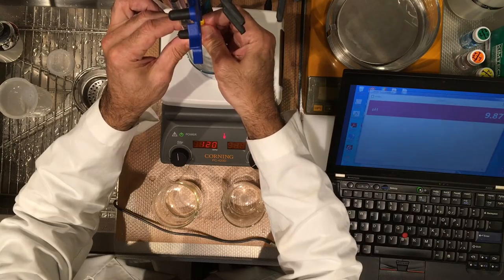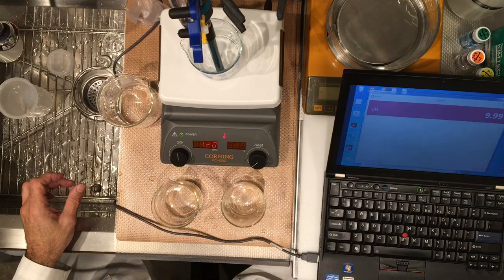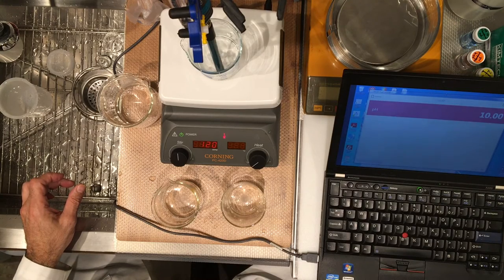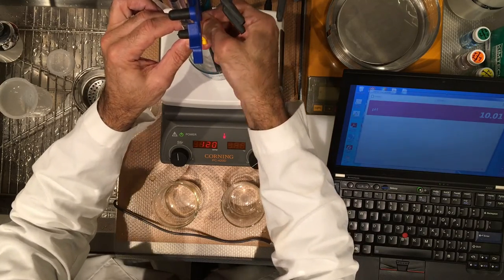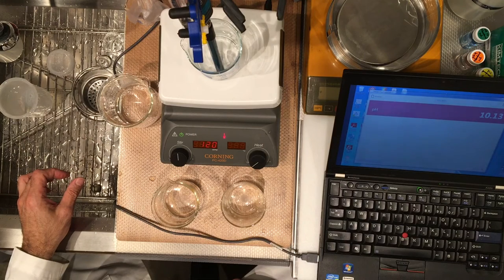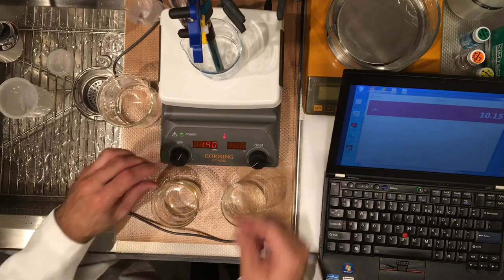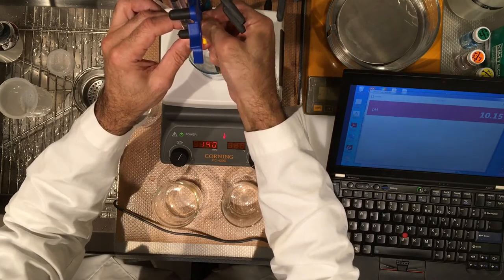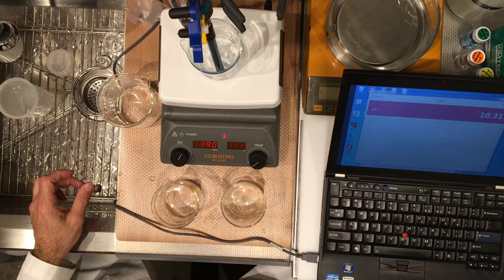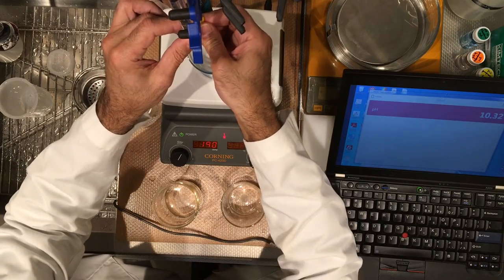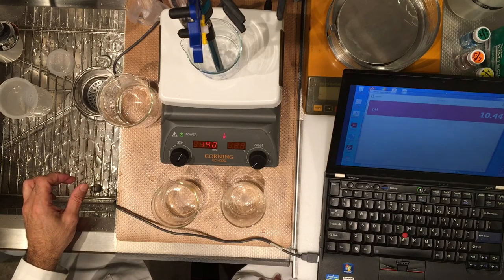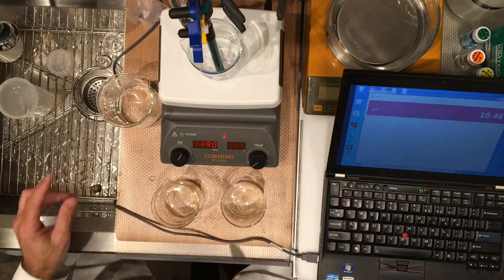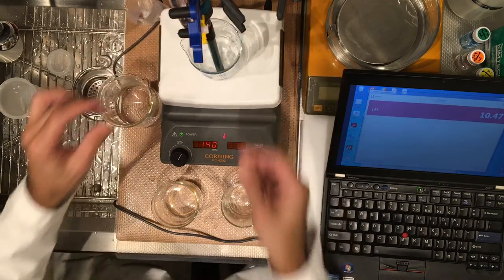11.40. 11.50. 11.60. 11.70. Now let's go to 12 now let's go to 12 I think we've passed the endpoint. At 12.